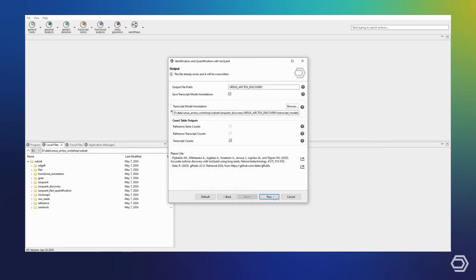Once again, we are ready to run IsoQuant, although I have previously done so and can skip ahead to my results.